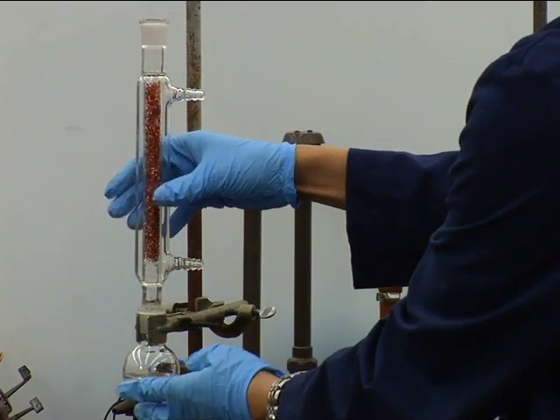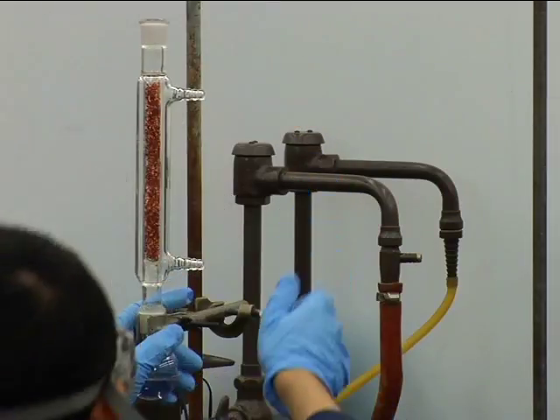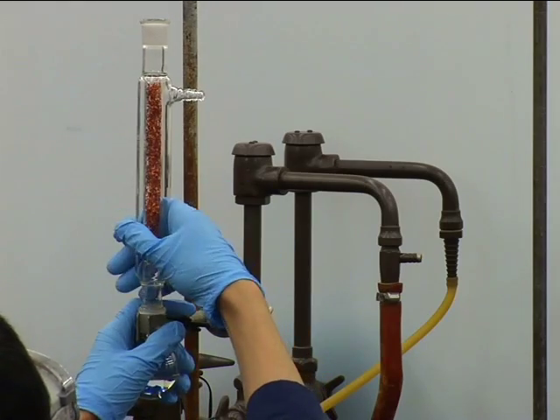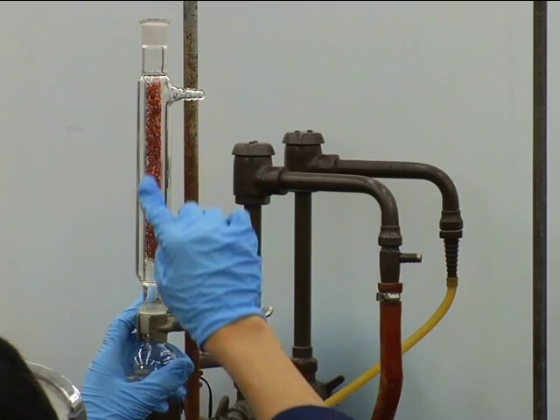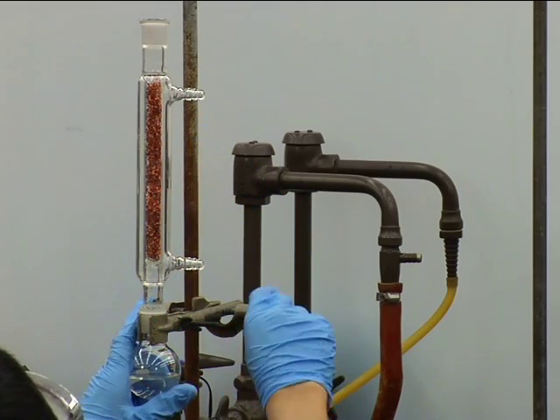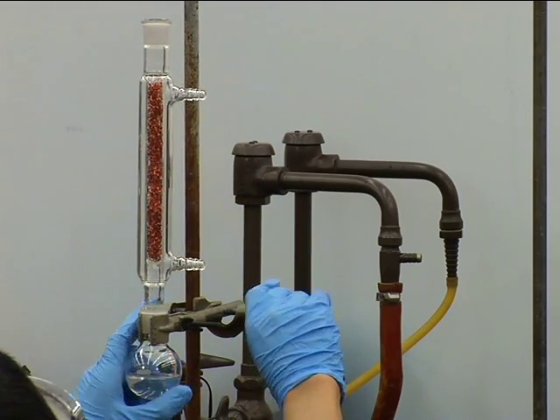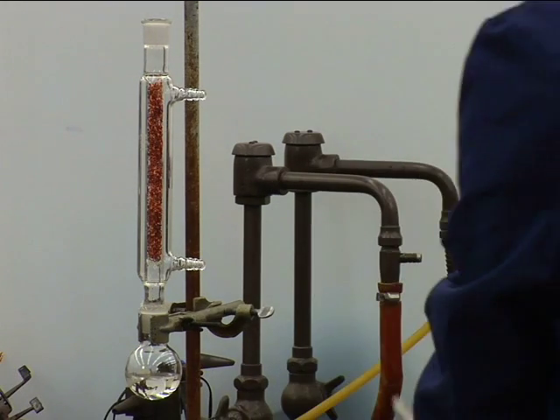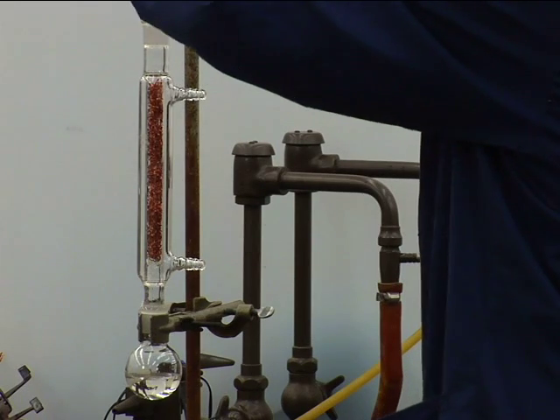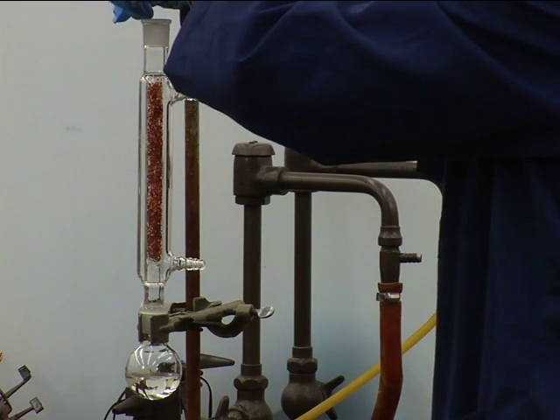Attach the packed fractionating column to the flask, making sure that the joints connect well. Adjust the flask clamp in its holder so that the column is as vertical as you can make it. If it isn't vertical, the condensate will drain to one side of the column and will not contact the rising vapor as effectively. The separation won't be as good.